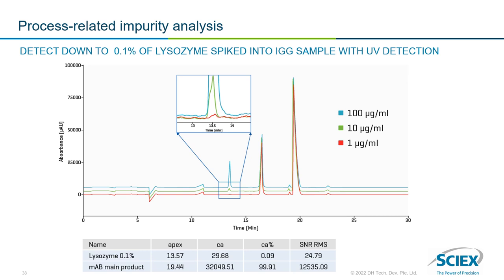The CE-SDS workflow can be effectively used to analyze therapeutic proteins and their associated product and process-related impurities with high resolution and sensitivity. Now I'd like to pass the presentation over to Dave Sloan from our partners at Redshift Bio to discuss some recent innovations in biophysical characterization of biopharmaceuticals.